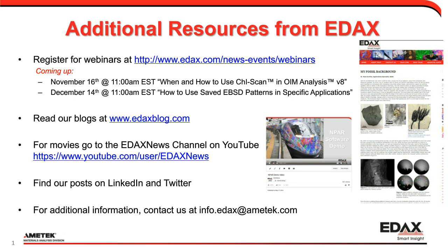With VP SEMs, we're able to work at higher kV, but introduce pressure into the chamber so that we're able to dissipate the charging. Biological materials don't conduct the charge of the E-beam away. They retain that charge and then they discharge it at events, but when we have variable pressure, they can regularly discharge.